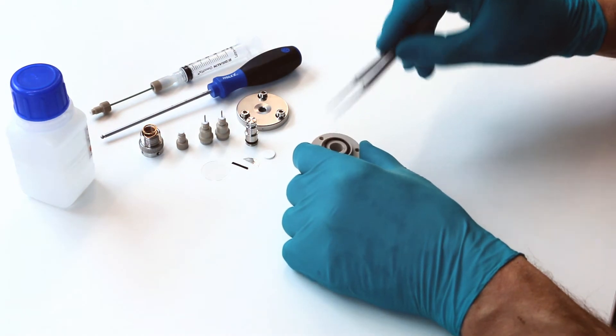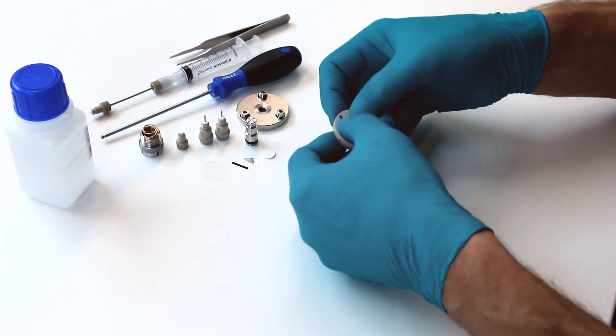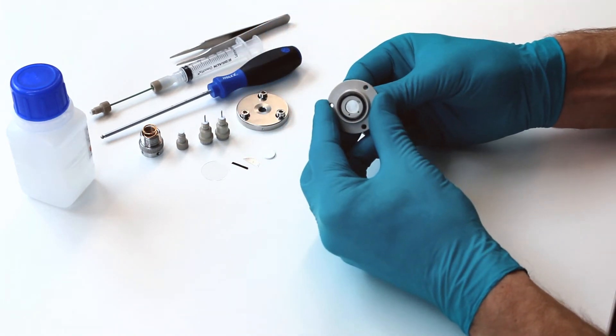Now, we start the assembly by inserting this O-ring seal into the cell base, then attach the central piston.